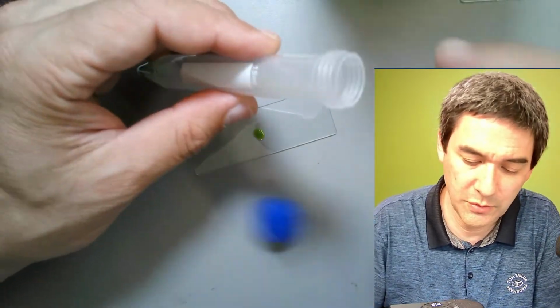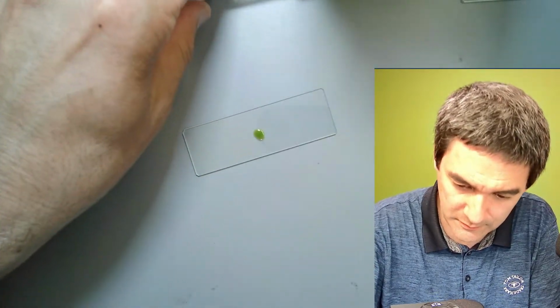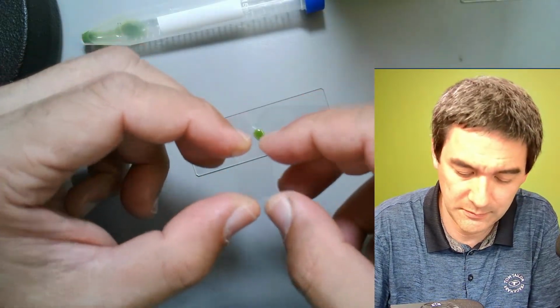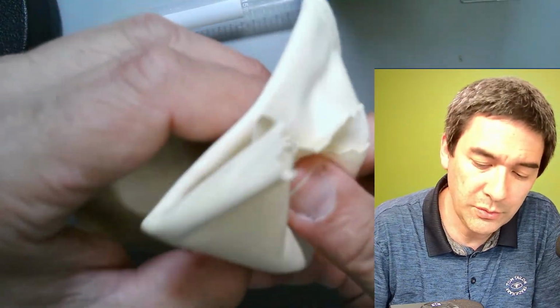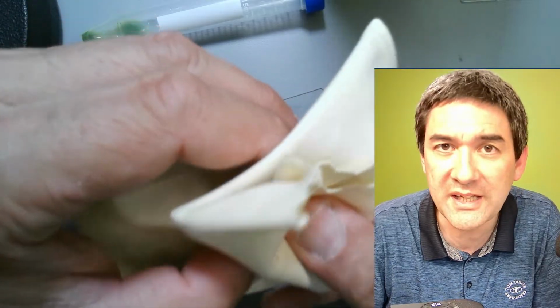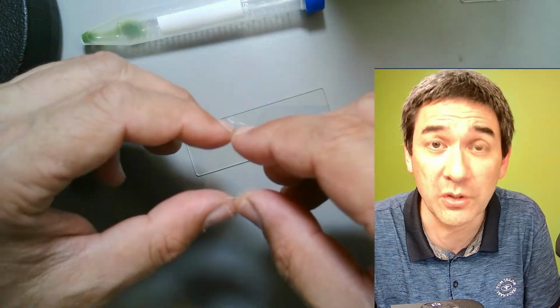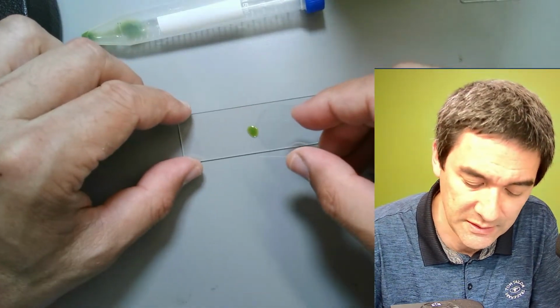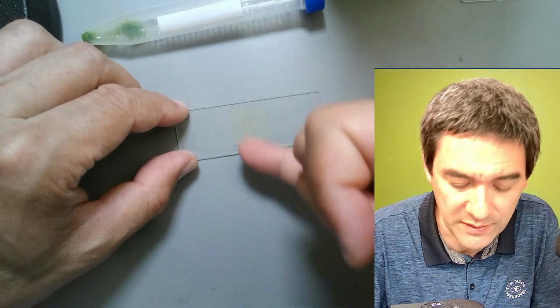Okay. I'm just going to put the lid on top so that I'm not going to spill anything. And again, a cover glass. When you keep water samples in your jar, there is in most cases always some kind of a progression, right? Certain microorganisms are going to start to disappear, others will start to appear, right? That's a completely normal thing. So let's try this here. And you see that it's a very thin layer. That's good, because I really want to go up with the magnification.